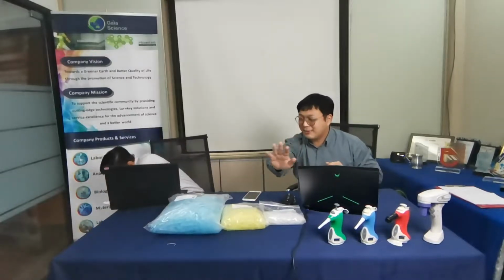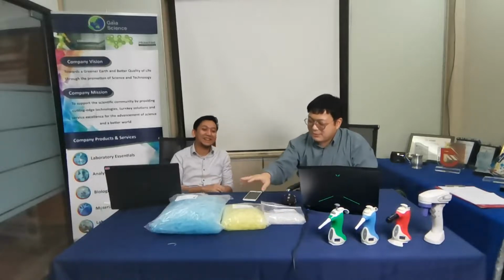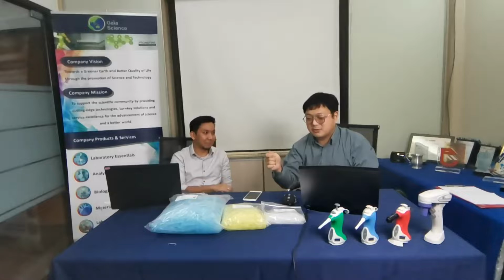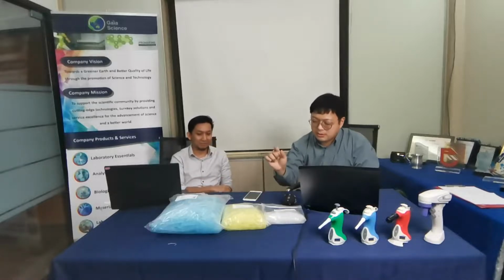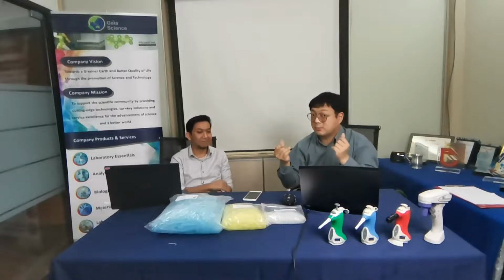Sorry if you're colorblind, but if you are, you can feel the difference in the size of the tips. One is really small, one is medium size, one is huge. So you can tell by feel as well.